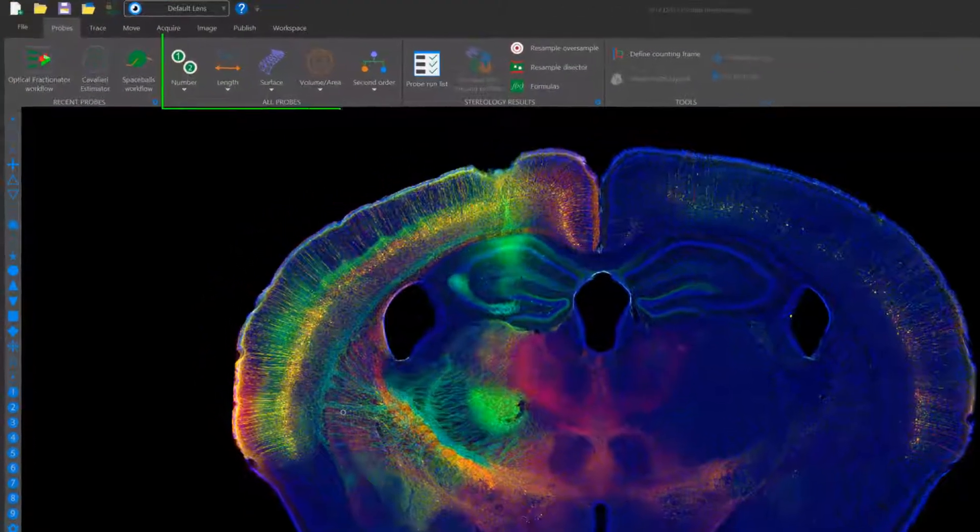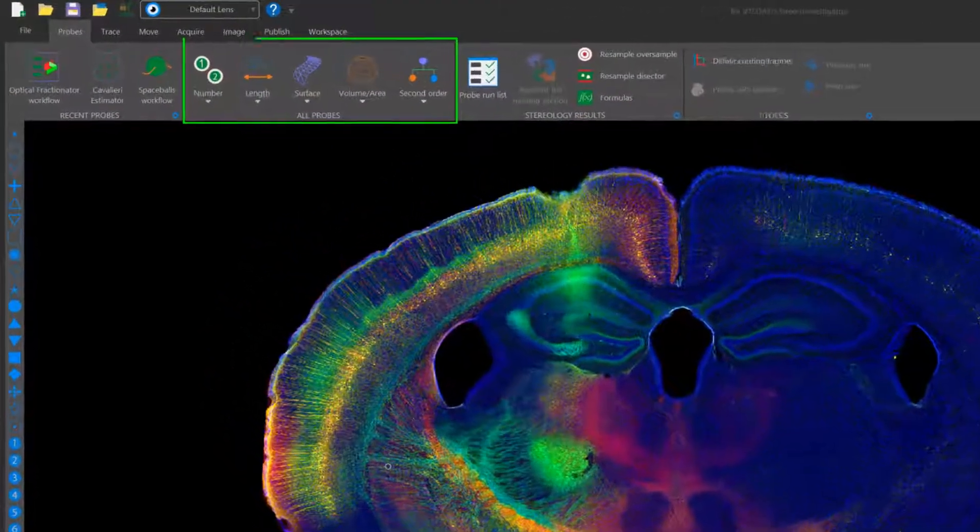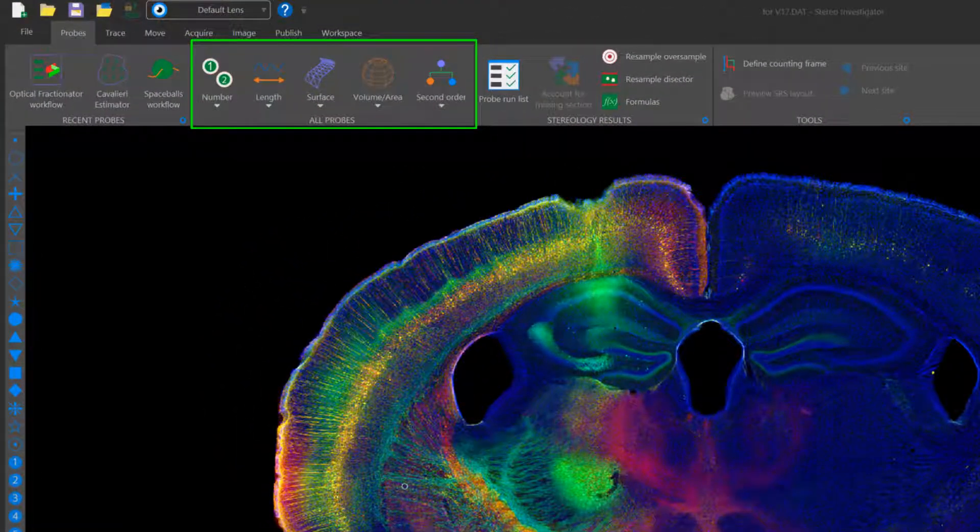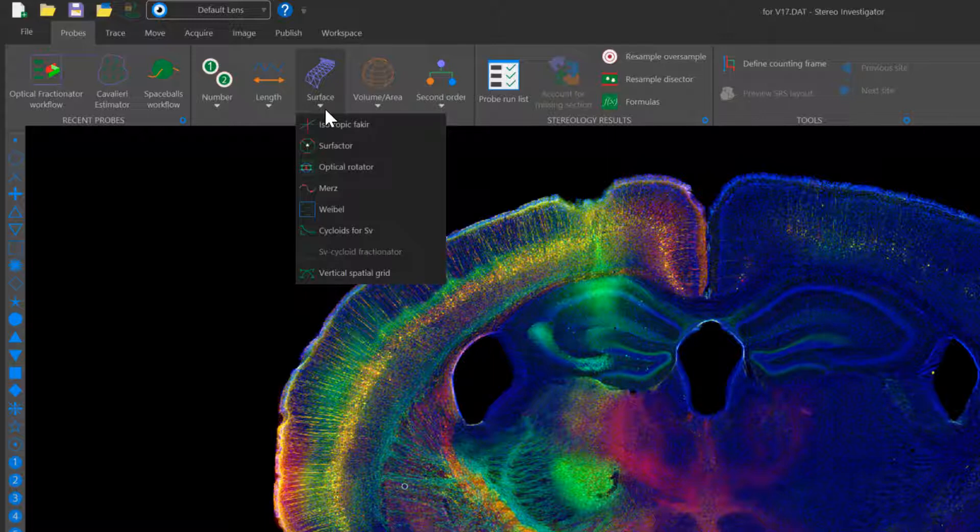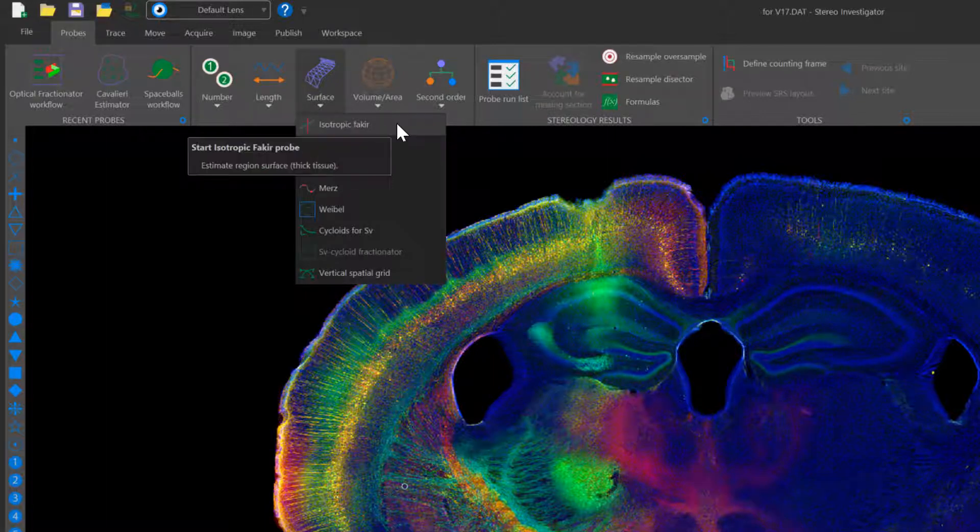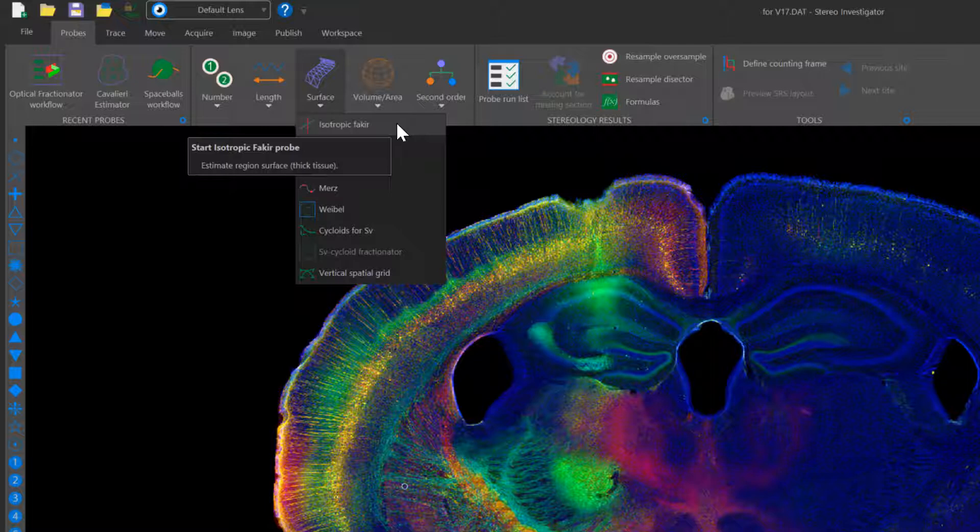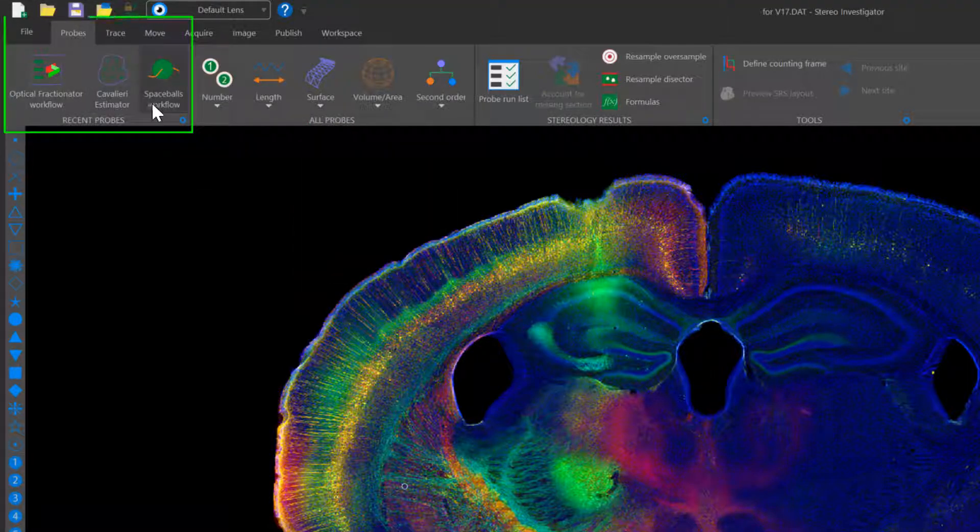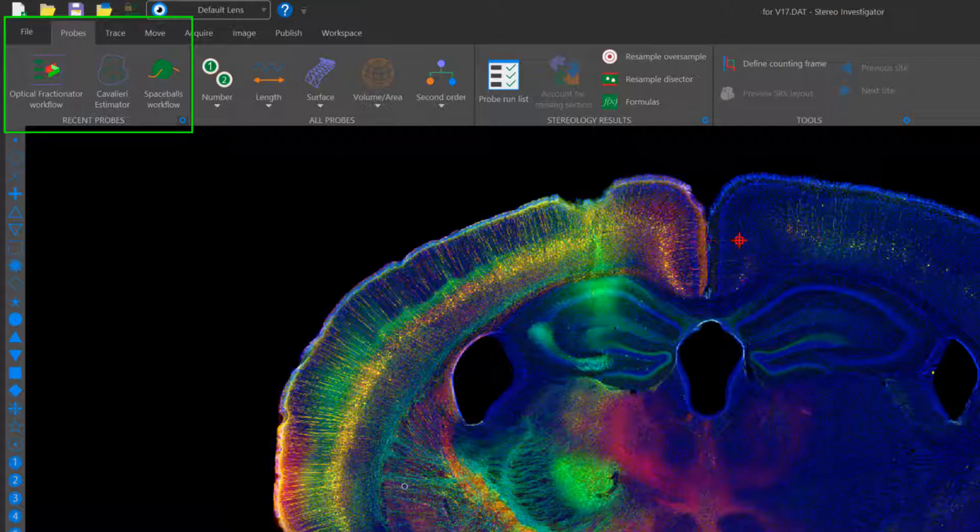Probes are organized by type of quantification, and next to each probe are helpful tips on whether the probe should be used with thick or thin tissue or regions or particles. At the left are your most recently used probes.